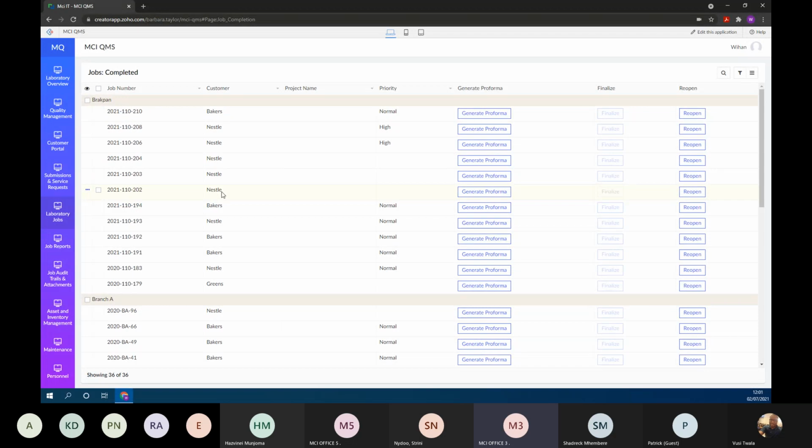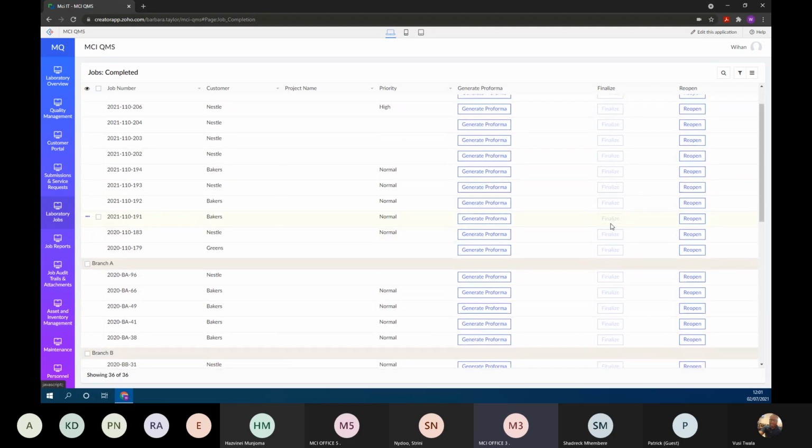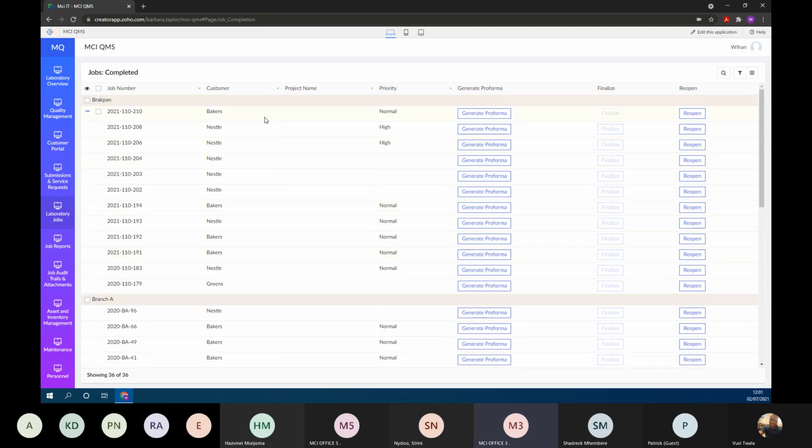But that is the one criterion, and then the other is to upload a final report. Now keep in mind that there are different methods to generate final reports depending on the nature of the laboratory. Some laboratories could even still prefer to do manual reports, so they capture all of their results in the system, but for whatever reason they just prefer to do the report in Microsoft Word in a certain format, and so forth. It doesn't matter whether you use the system's built-in reports, an Excel export, a report built with pivot tables, or even a report that was generated from outside the system.